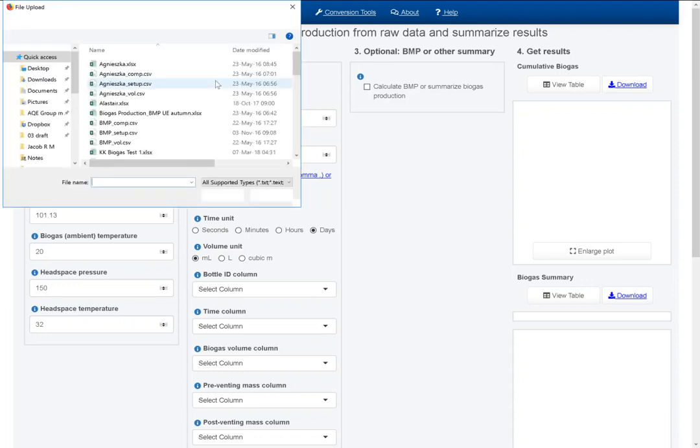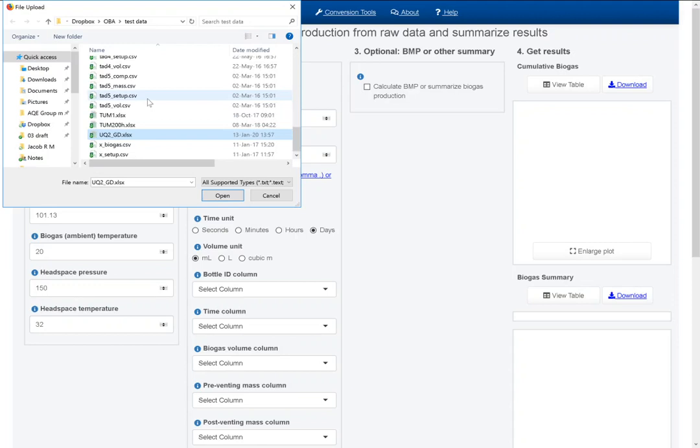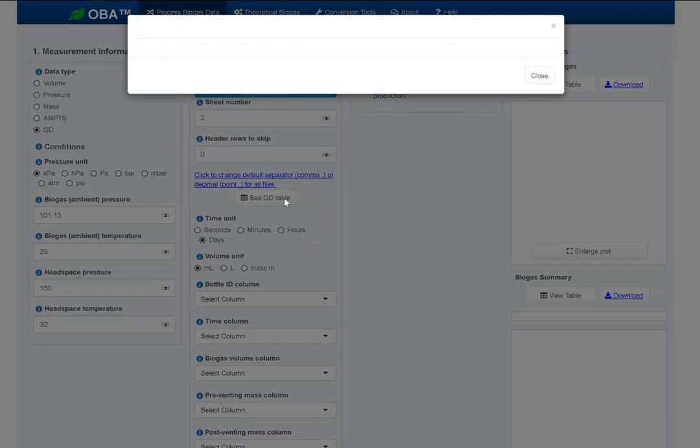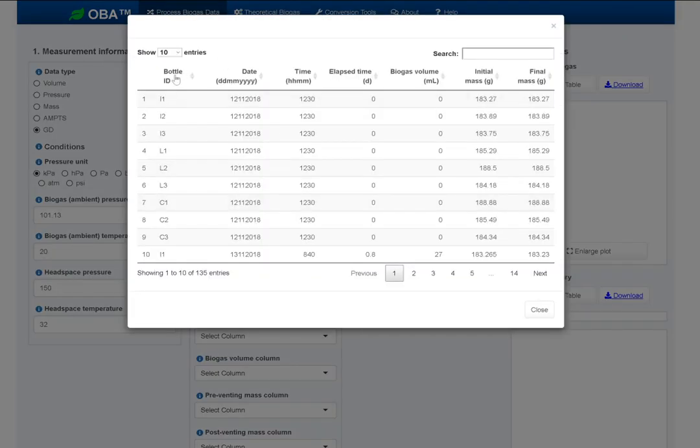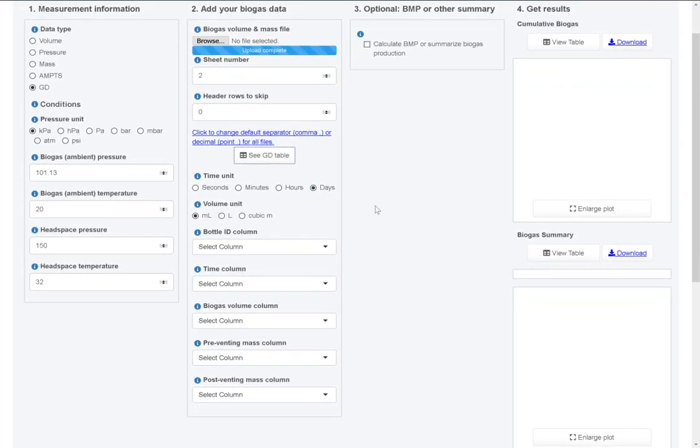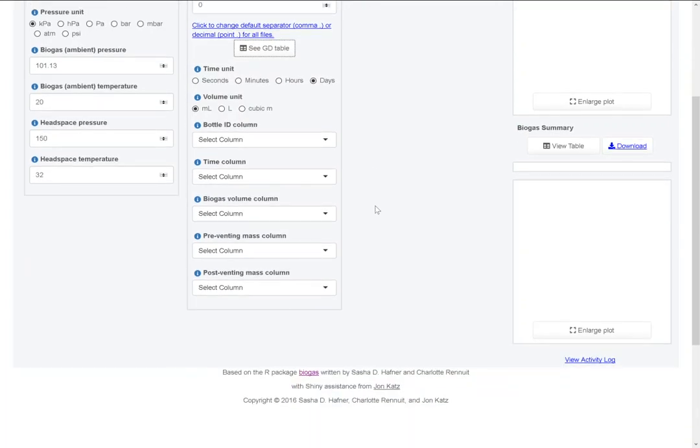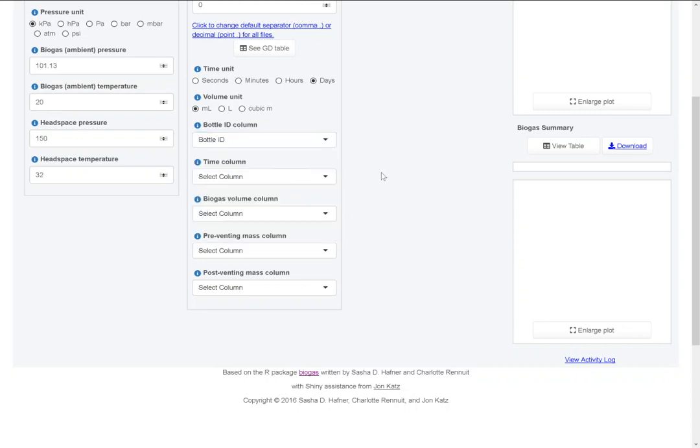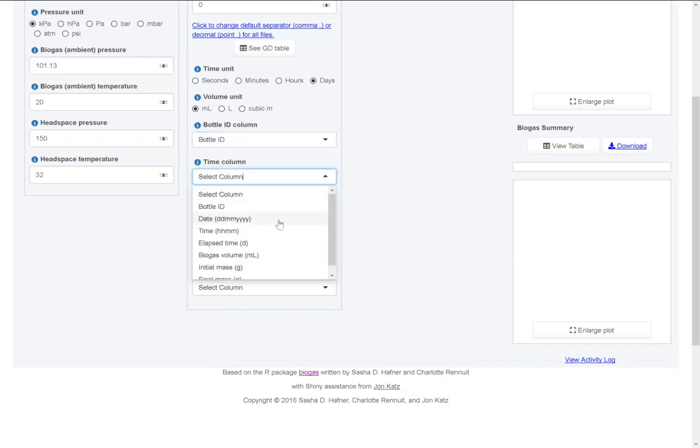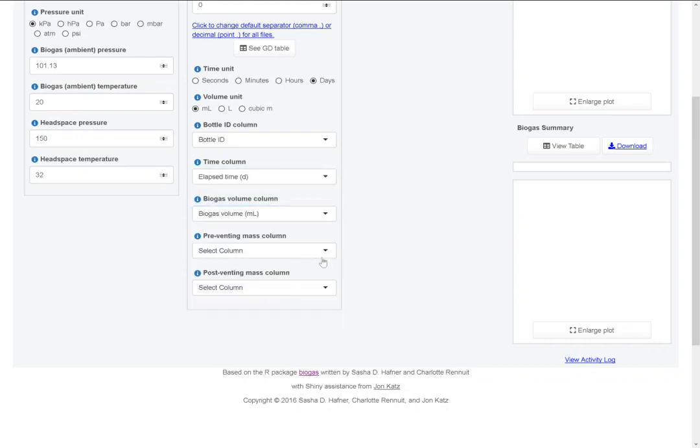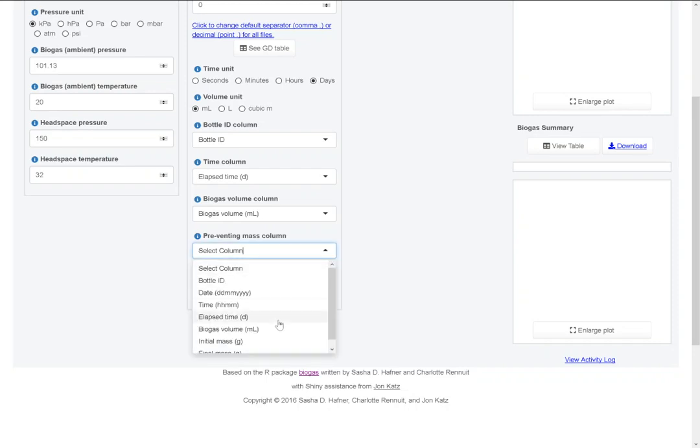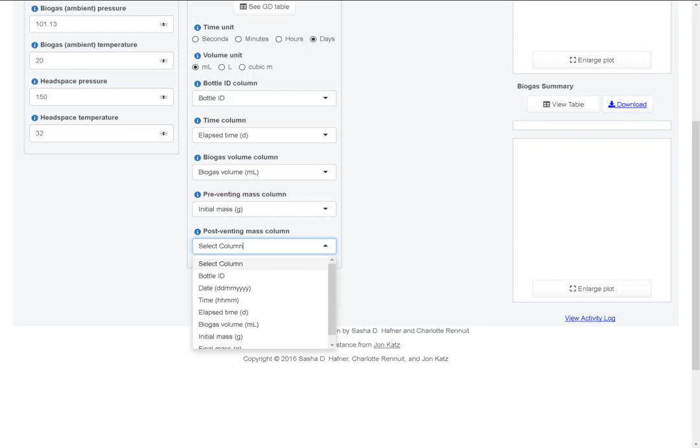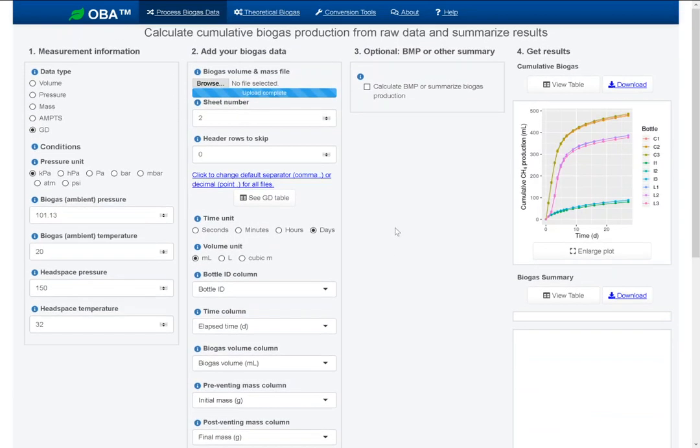I'm going to select this same file that we were just looking at. Sheet 2 has our biogas volume and mass data. Let's look at the preview here to make sure it was read in correctly, and it looks like it was. We're going to work with bottle ID, elapsed time, biogas volume, and these two mass columns. We need to indicate the unit for time, it is in days, that's correct. Volume is milliliters. The bottle ID column is called bottle ID. Time is elapsed time. Biogas volume. Pre-venting mass here is called initial mass, and post-venting mass is final mass. That's all we need to get methane production.